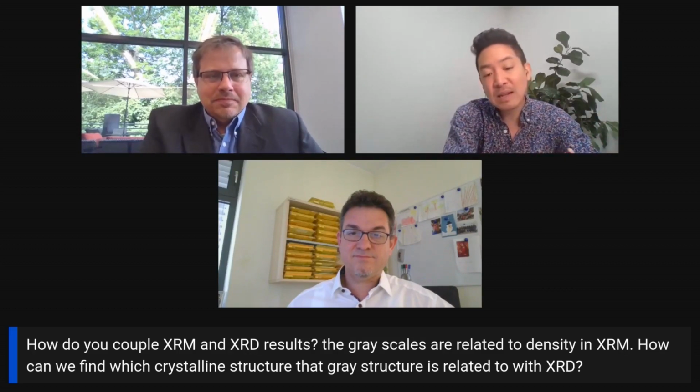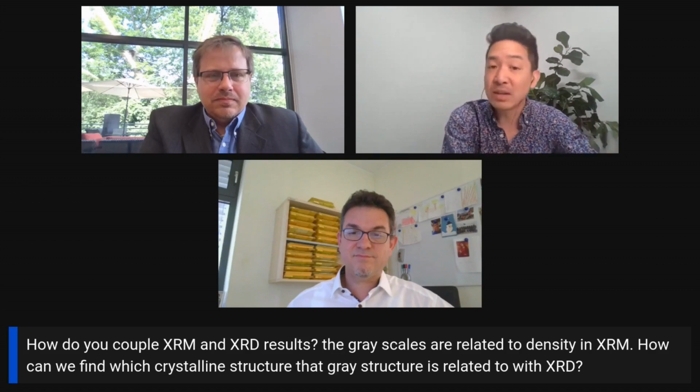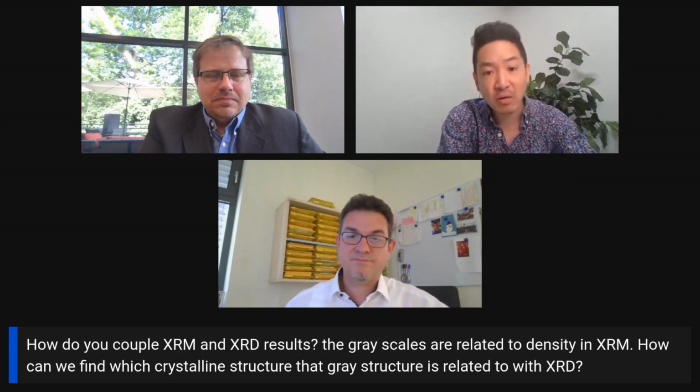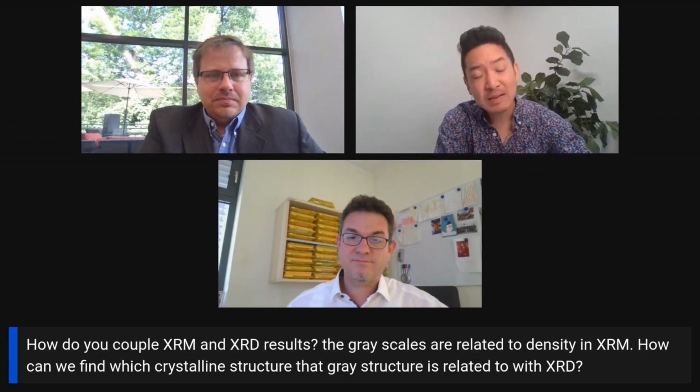Then I would take, say, the same tablet, I would crush it up and throw it in a diffraction experiment, and I would see a signal from everything that is in there. So I would say, maybe I've got a broad feature from microcrystalline cellulose, and I have some small little sharp peaks. I could then go back in and try to identify those sharp peaks and say, which API is it?